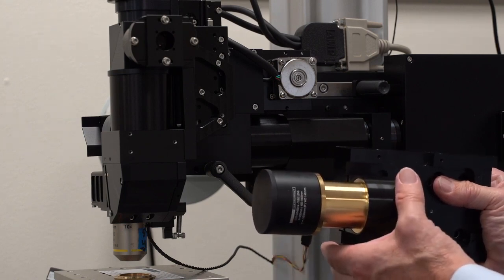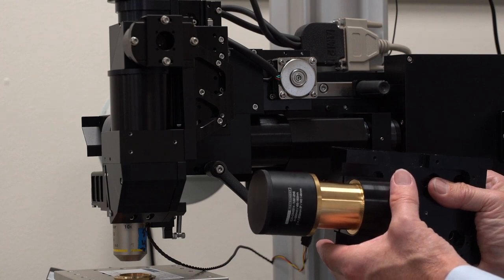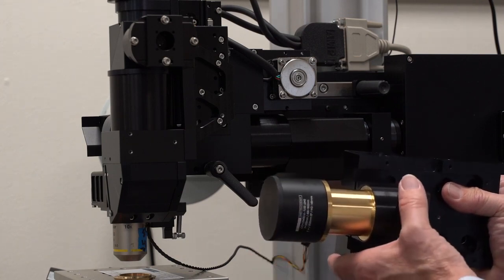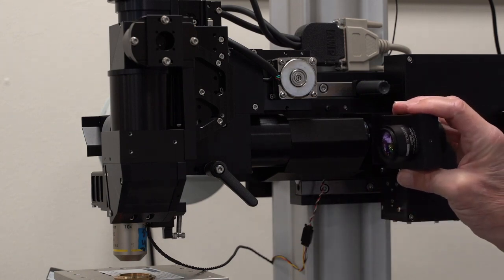We originally started building 3P MOMs using the Thorlab scan and tube lenses, but have now moved to our own optics so we can guarantee supplies. The scan lens changeover simply requires a scan lens mount with a smaller diameter hole for the alternate lens.